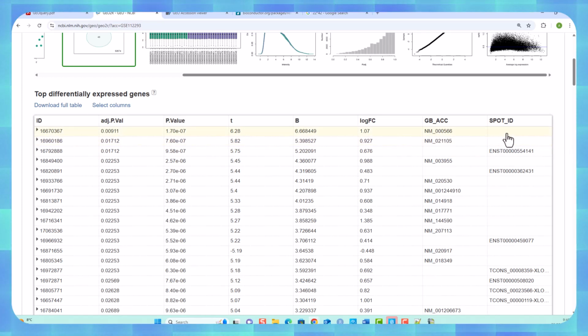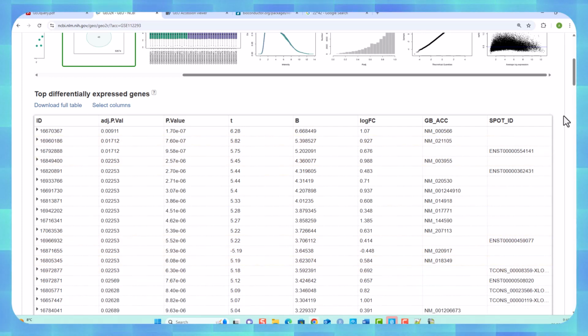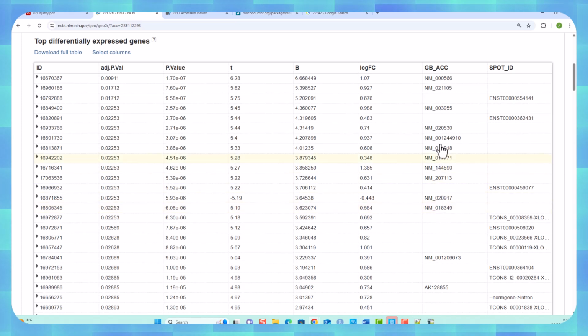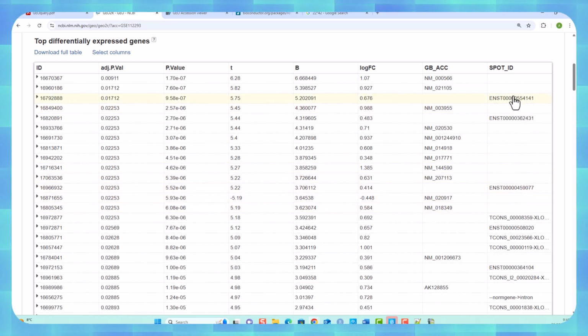So if they're not associated here with a particular thing which is in the database, then it means these are oligonucleotides which are known to be within a conserved part of the genome, but we don't actually know what they're doing. So you can look these up and find what they are, but they're not well defined, whereas these things are.